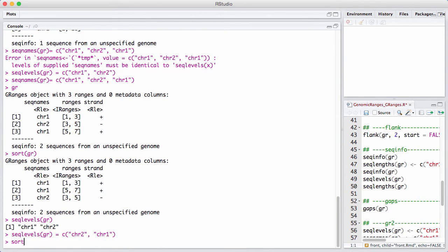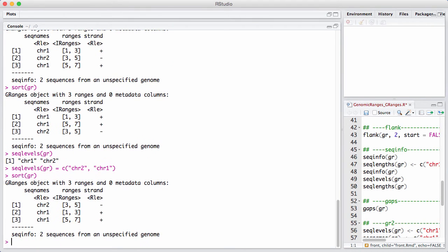And then we are going to sort the GRanges again. And now we see chromosome 2 is the first range that comes out.